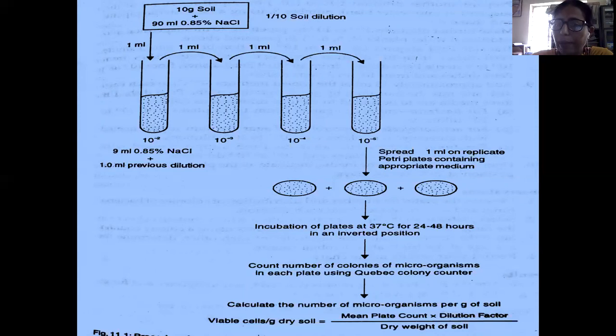So 10 raised to power minus 5 and minus 6 dilutions are taken and plated in 3 plates so that replicas are maintained. Incubate the plates at 37 degrees Celsius for 24 to 48 hours in an inverted position. After incubation we count the colonies and calculate the number of organisms per gram of soil.